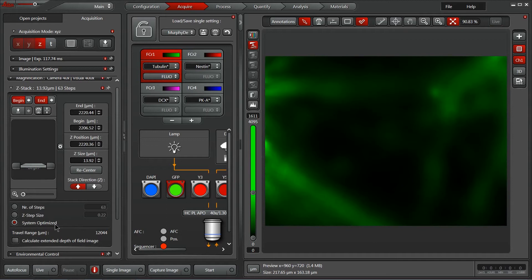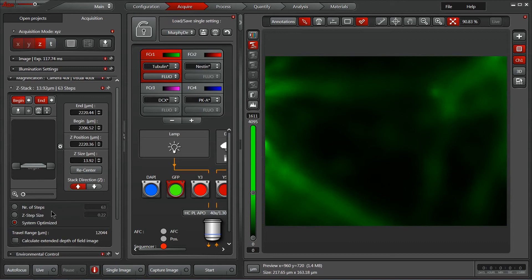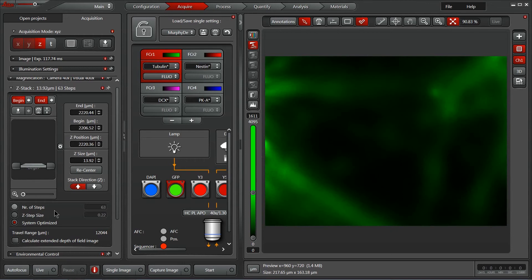So with our system optimized feature the software will automatically calculate the number of steps and the size of each of those steps to reflect the best choices for the objective. In this case it takes into account the Z resolution of the objective which the system knows and uses that to assure that we are sampling at an appropriate rate in the Z dimension.